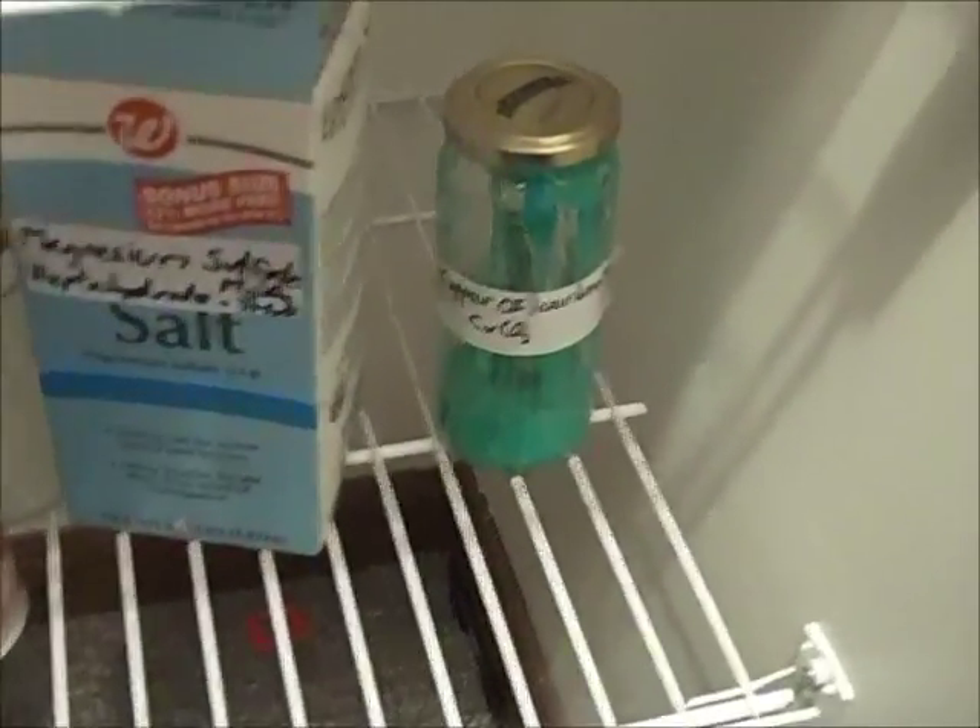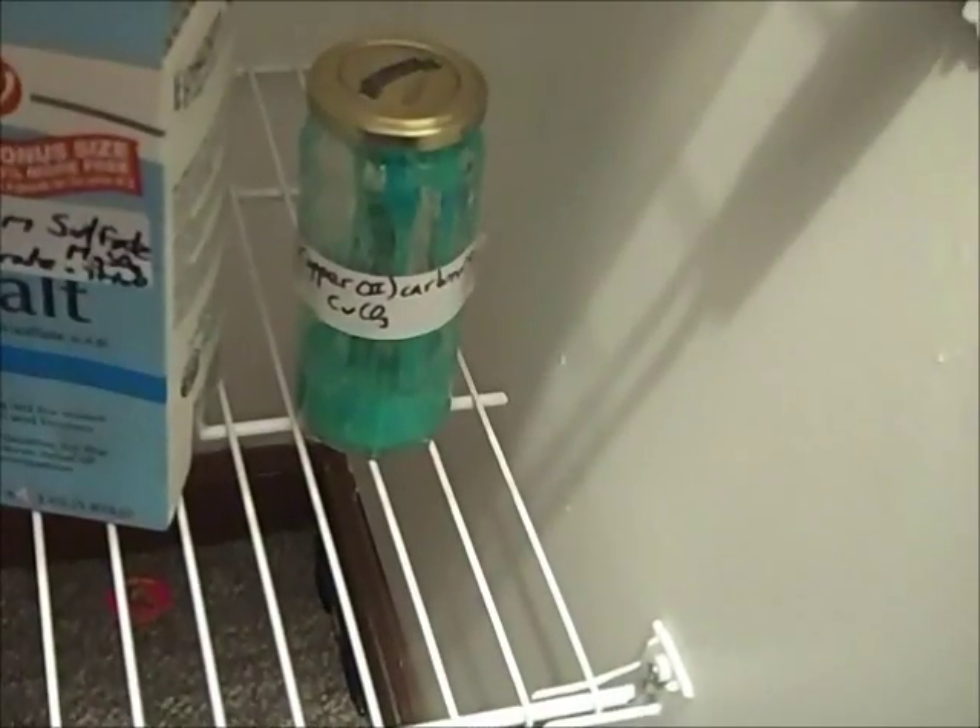And finally are my chemicals, which are less hazardous, so I just keep them all together. Here is copper carbonate I talked about earlier. You get it from copper sulfate and baking soda mixed in stoichiometric amounts and dried, filtered.